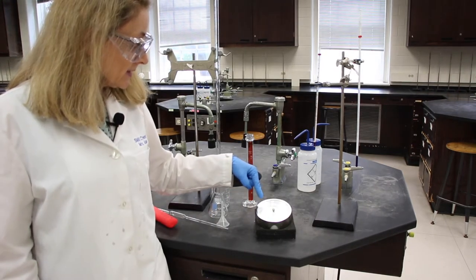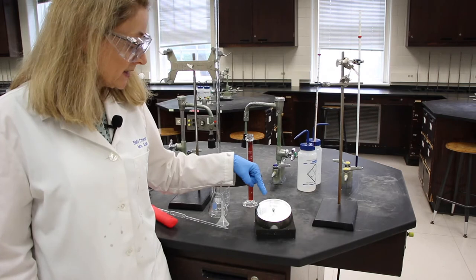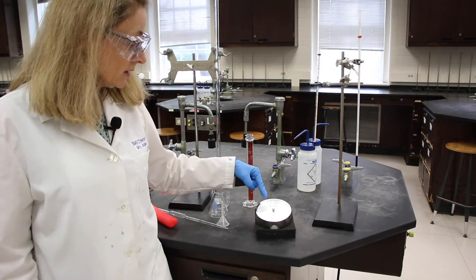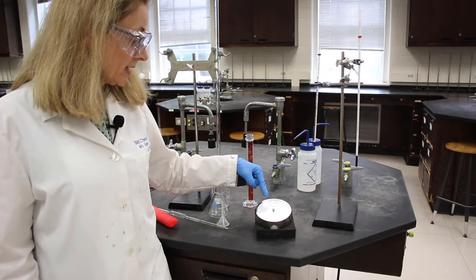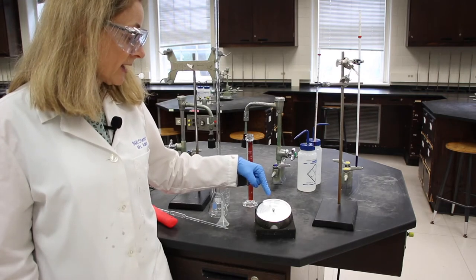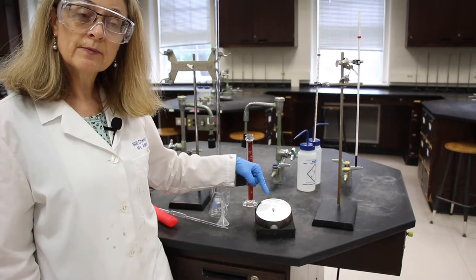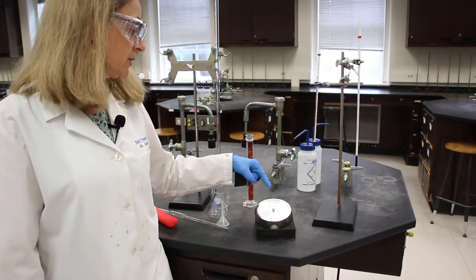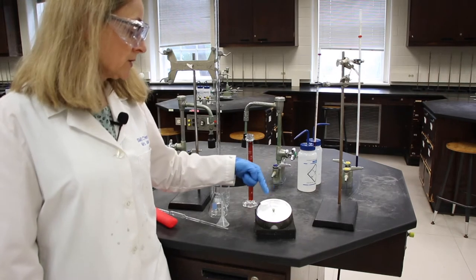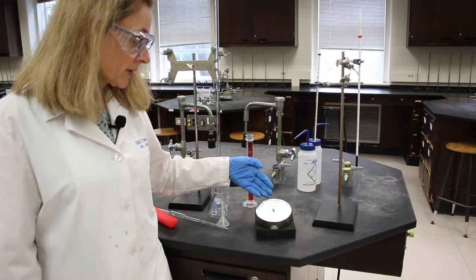This one is between 750 and 760, and again, I'm just counting the smallest divisions, and it looks like it's between 755 and 756. So we're going to read to the 755 and estimate to the tenth.